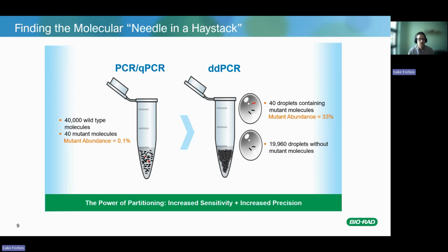If you really want to count the number of needles in that haystack, you're going to take that large stack of hay and you're going to divide it. And in digital PCR, you divide that haystack over around 20,000 times. And in some of those haystacks, there'll be needles and you'll be able to count them quite easily because they'll be separate, and others they won't.